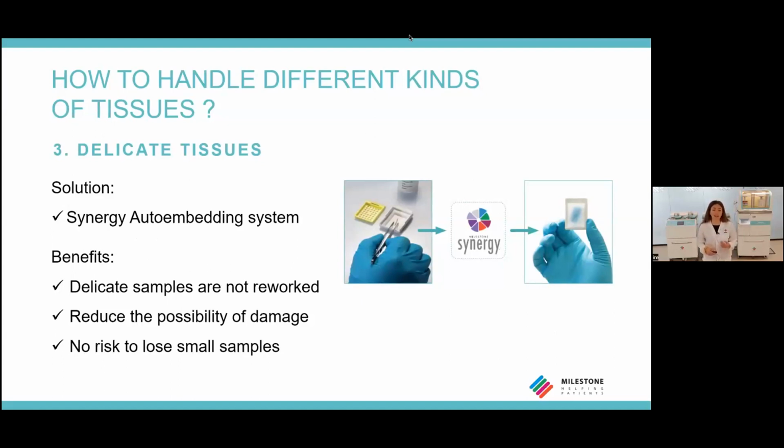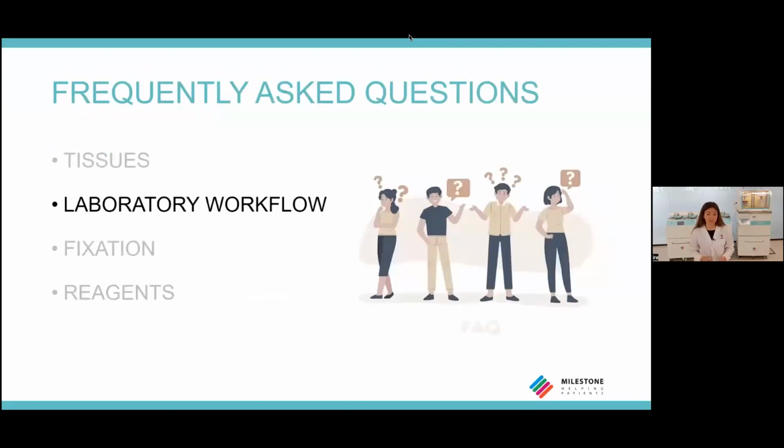So this helps in better managing the specimen, and another advantage is that it avoids the loss of the small samples.